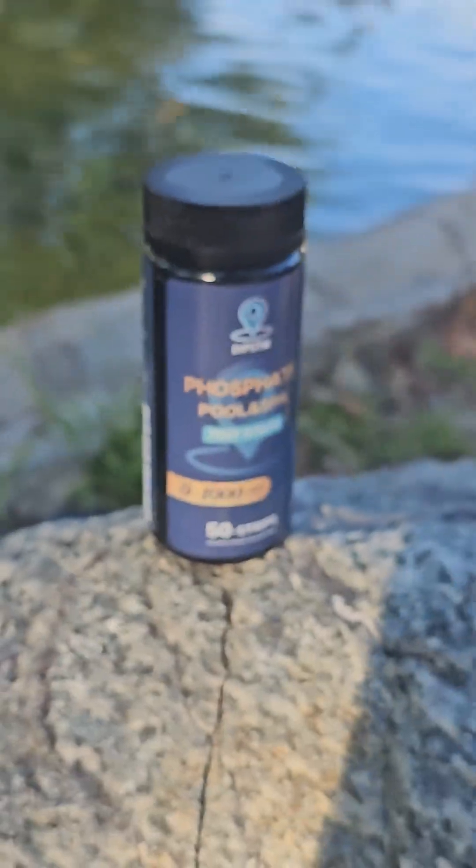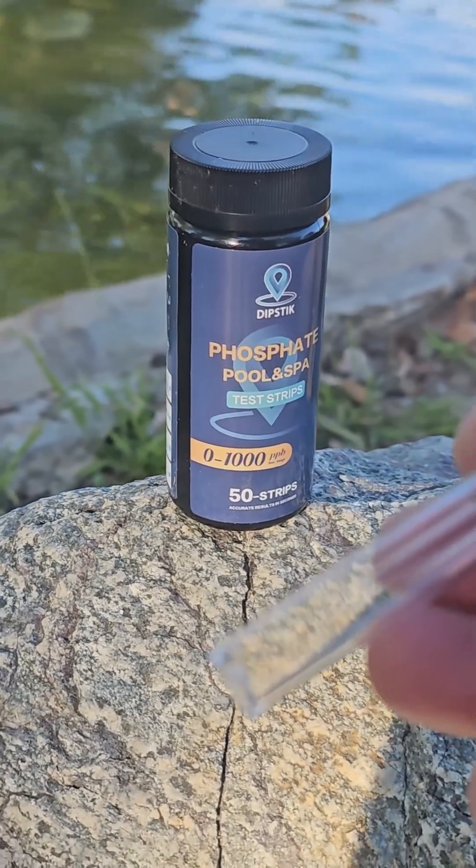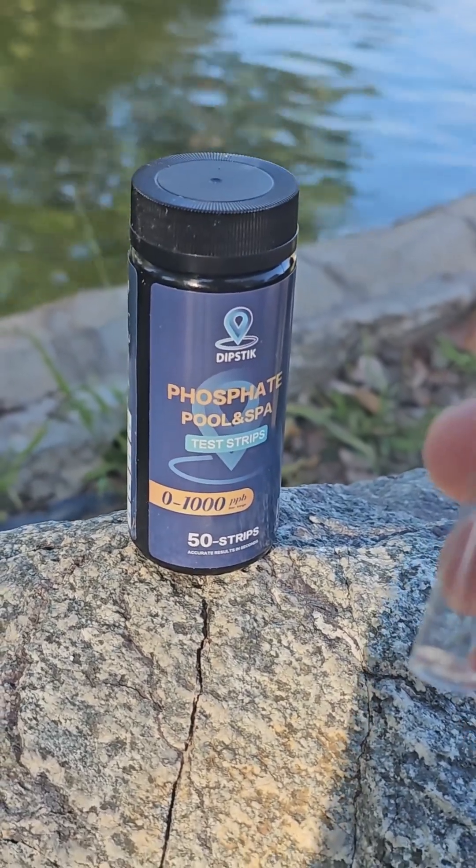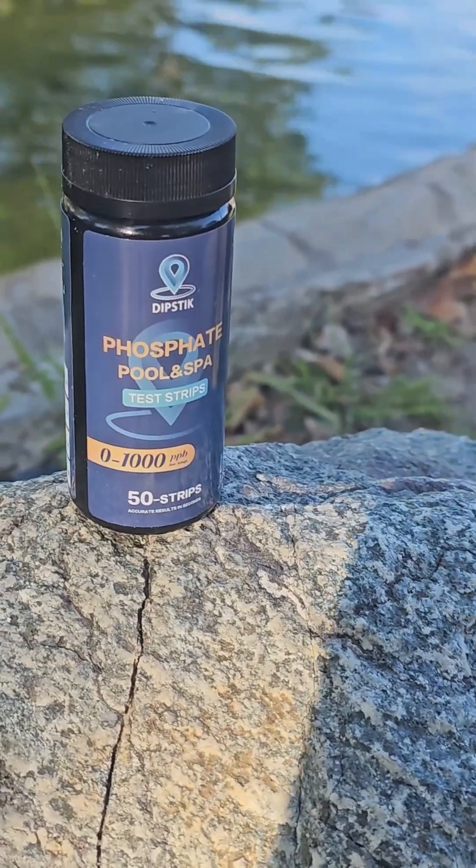You grab one of the strips, you put it in here. Make sure that the strip bottom part of the reading part is facing towards the water. I know we need chemicals in here, so we're going to grab a little bit of water.